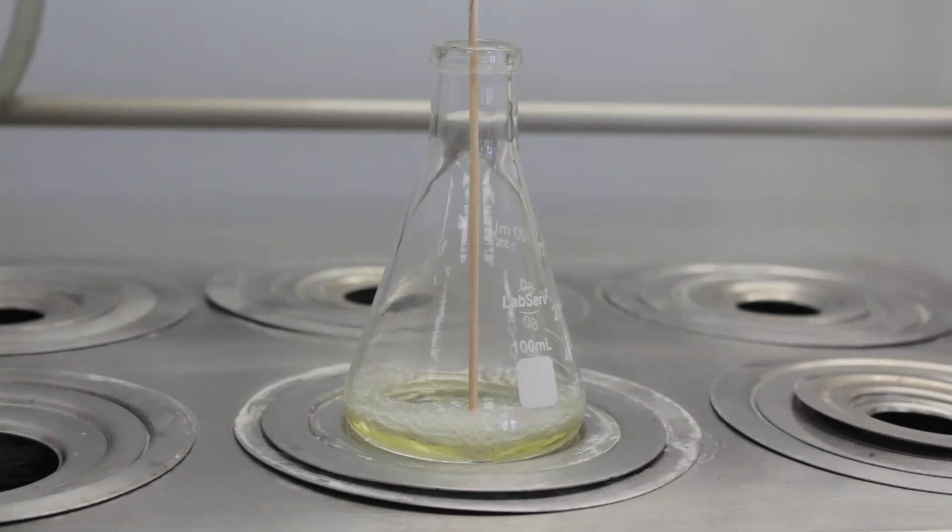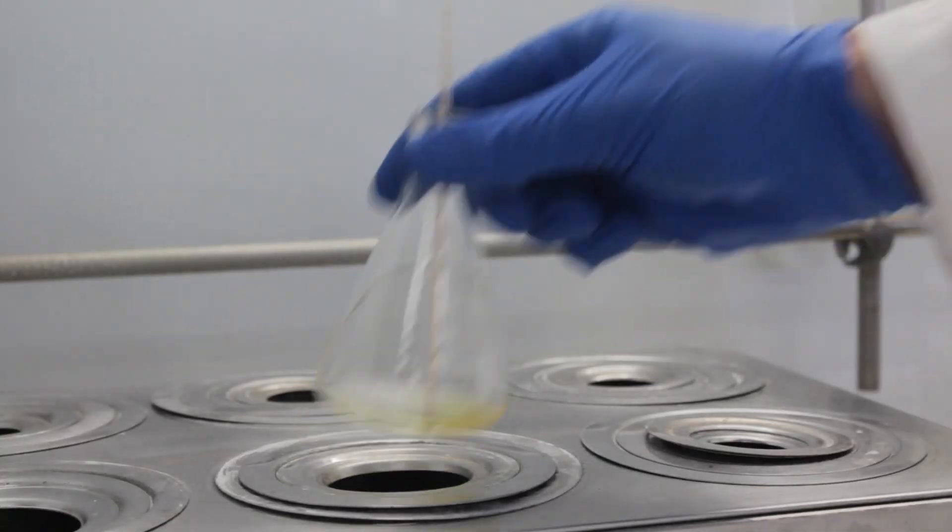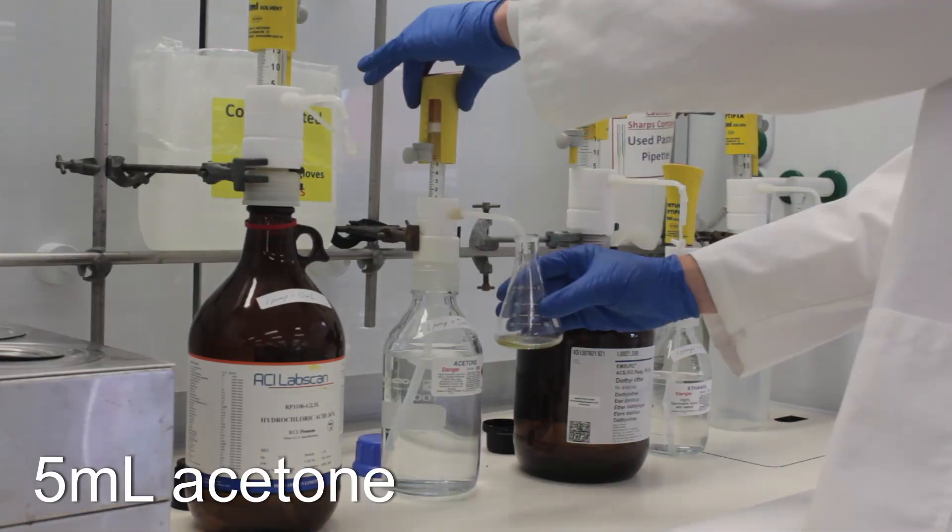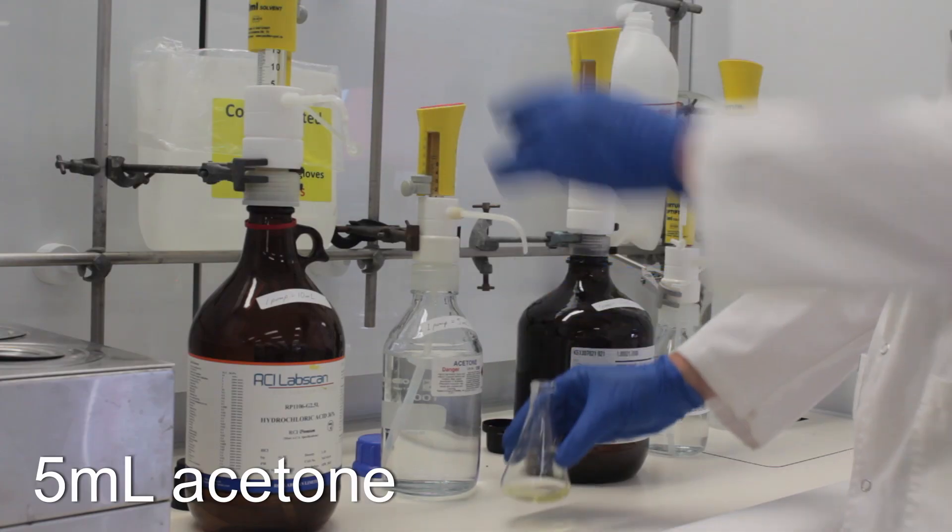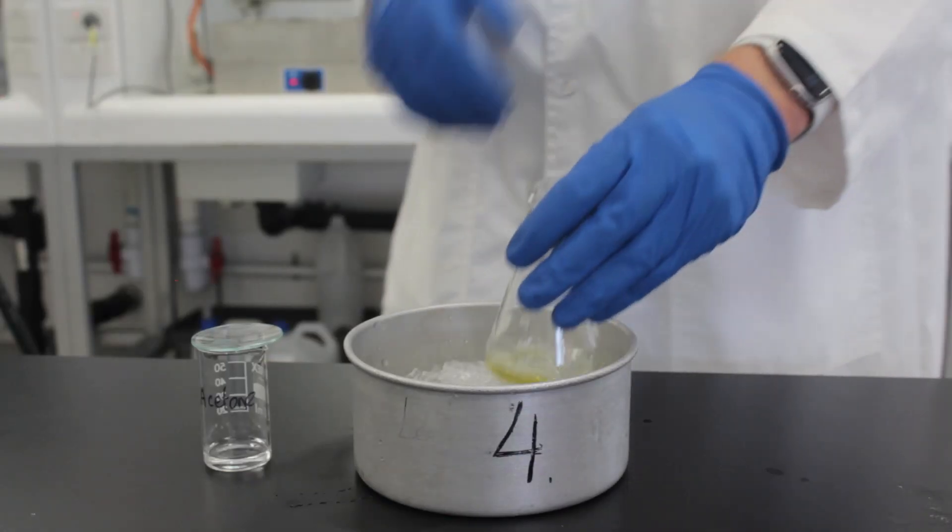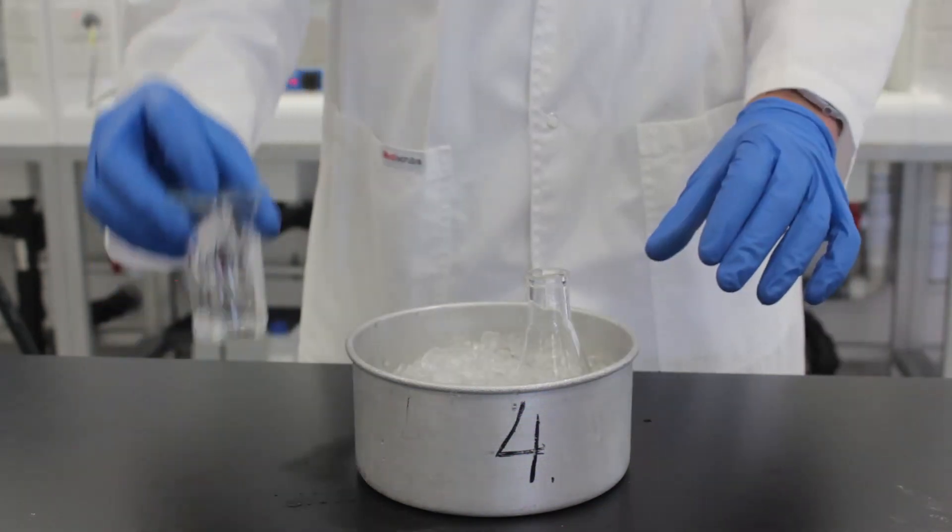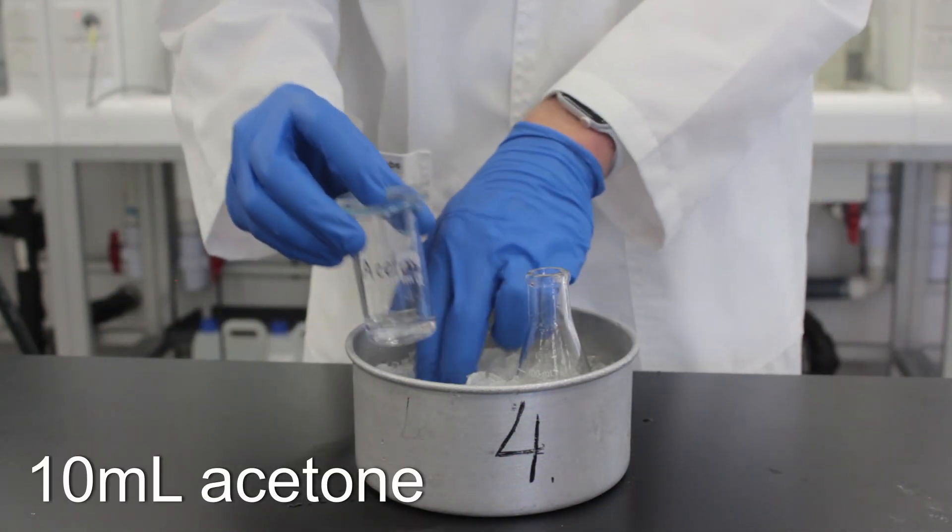When the diethyl ether is done evaporating, discard the boiling stick in the sharps container and add 5 ml of acetone to the warm yellow oil. Take it back to your bench and cool in an ice bath until it recrystallizes. Cool some spare acetone while you're at it.